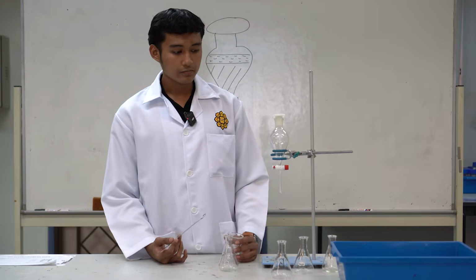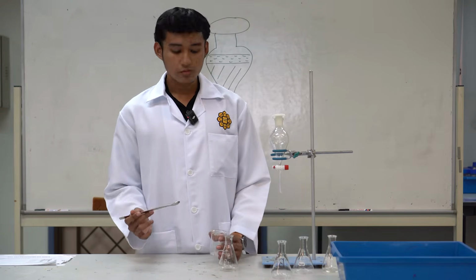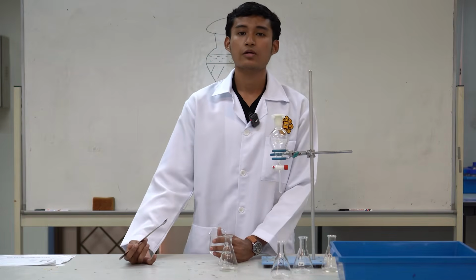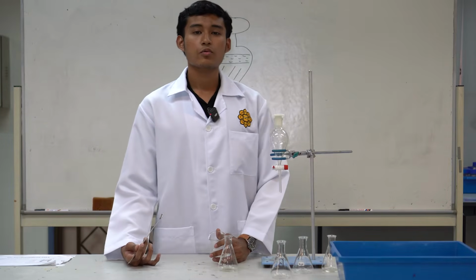We use this spatula to take and weigh it until we get 0.2 gram of each. We don't need it to be exactly 0.2 gram. It can also be 0.211 or 0.199.